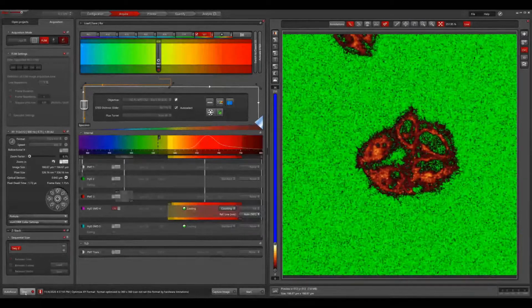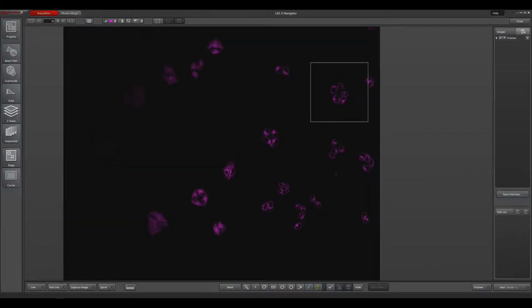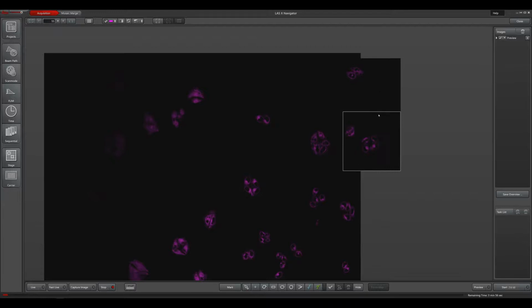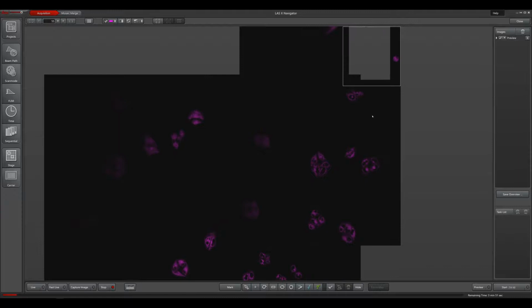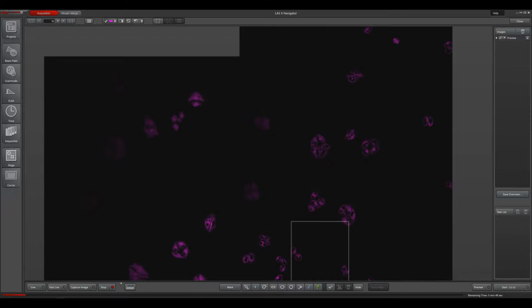This is just the current position that we're looking at right now. If you want to know how cells in the vicinity of our current position look like, we can quickly move over into our Navigator window. And here, as you can see, I have beforehand created a small overview using our spiral function, which, if you click on it, moves around our current position in a spiral way and keeps adding more and more neighboring positions until I press the stop button.